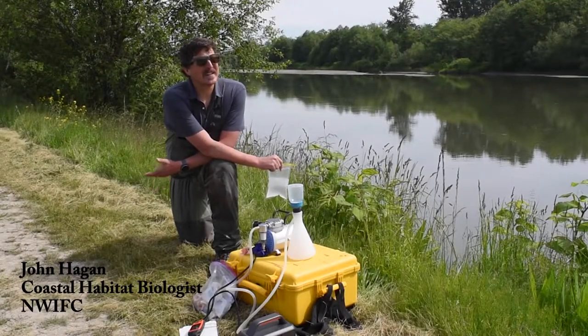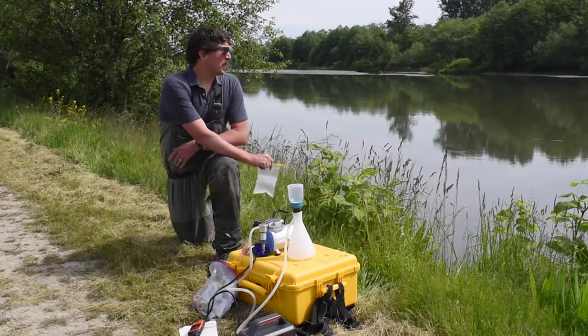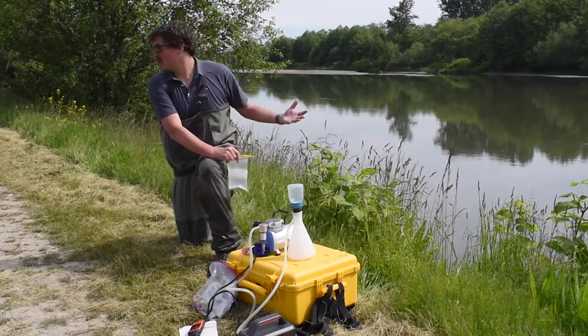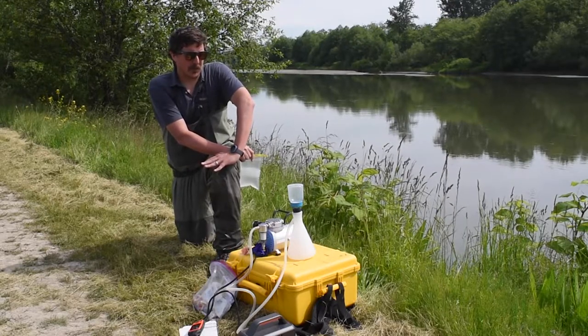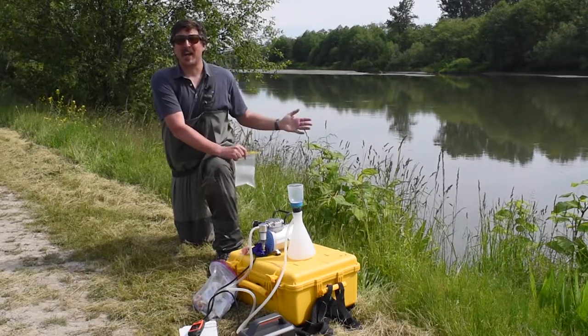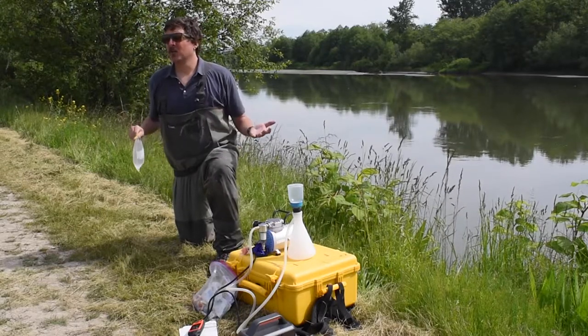Environmental DNA — for those of you who don't know — refers to DNA shed by anything living in an aquatic environment. This process allows us to determine what's in a water body based on the DNA in a water sample. It's a very powerful and useful tool.